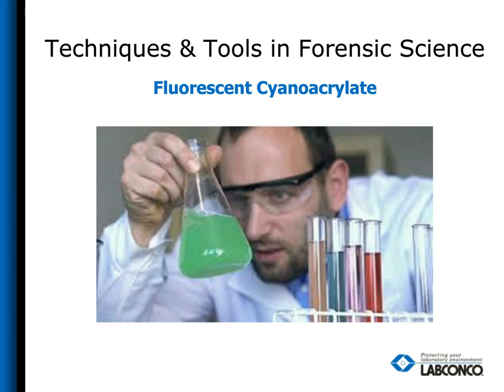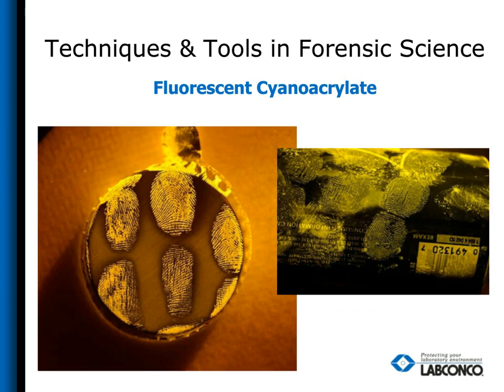I've tested several of the brands, and here's some results of some of our tests using the BT capture chamber. What we have found out, though, in our testing and the use of these different infused dye stain cyanoacrylate formulas is they are very, very sensitive to temperature, humidity, and time. They're sensitive to the point that if you try to use these in a lot of the different automated chambers out there, which we've used several different brands, you will not get the same results. And a lot of times they won't even fluoresce at all.